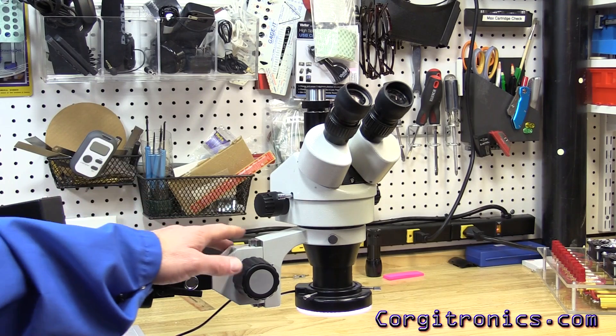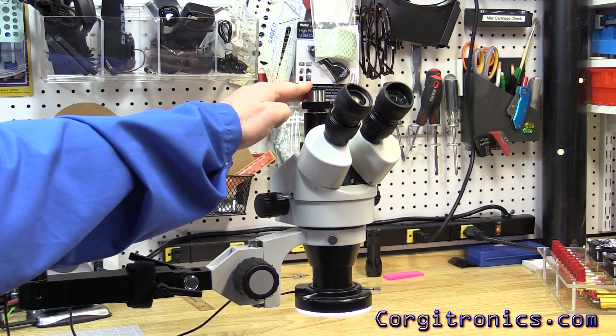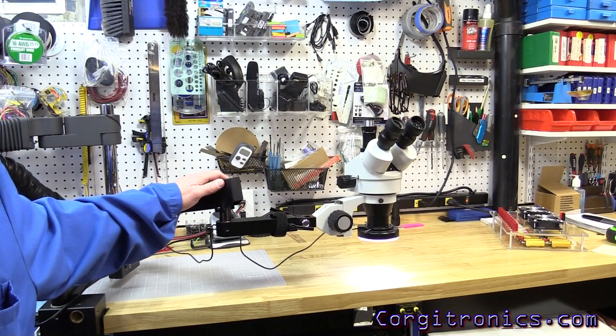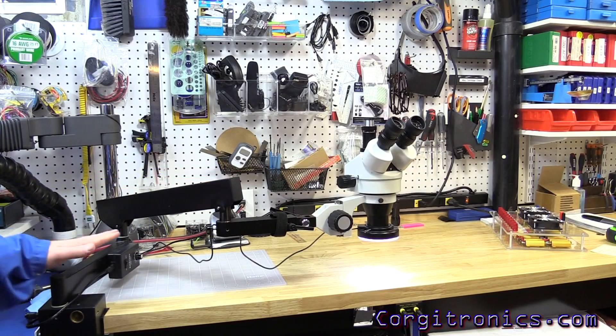There have been a lot of questions about the Amscope microscope, especially the Trinoc and various mounting options. Let's look at the articulating arm — it's a little hard to explain just in pictures, so let's take a look at what you get.